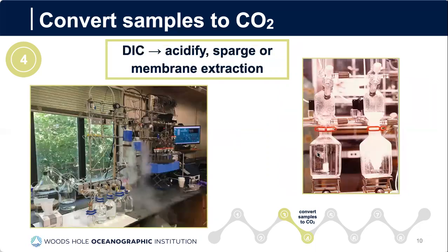For water samples, DIC is also acidified to generate CO2, which is then sparged from the sample, as shown in the photo here, or extracted over a membrane on a system which we have here that we call Redix.